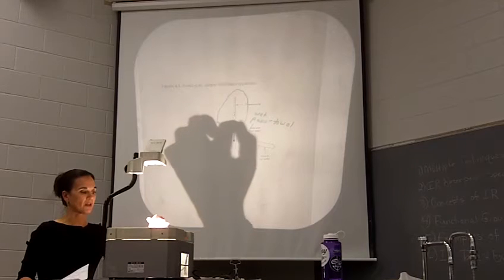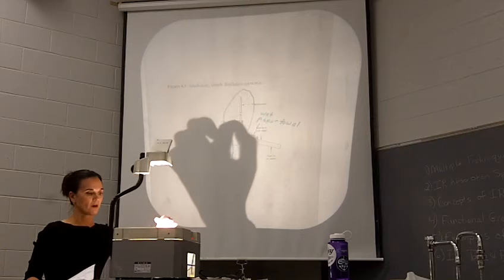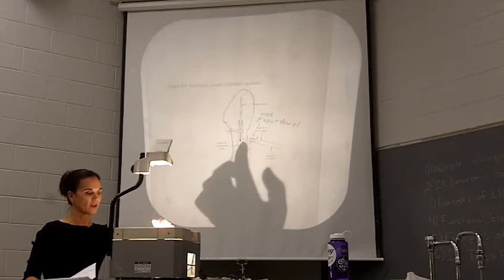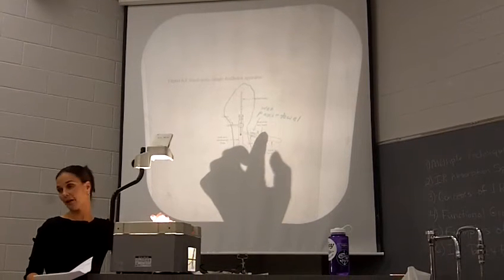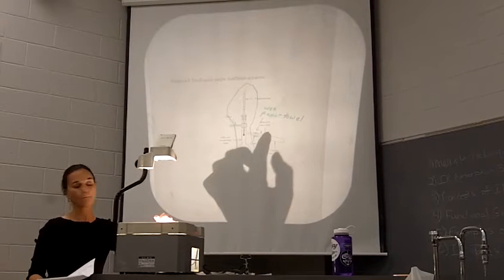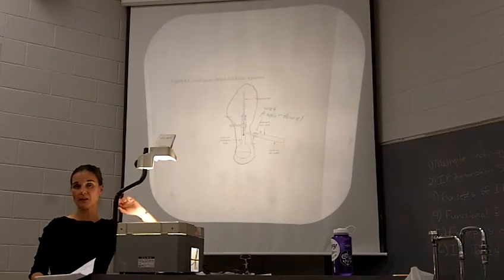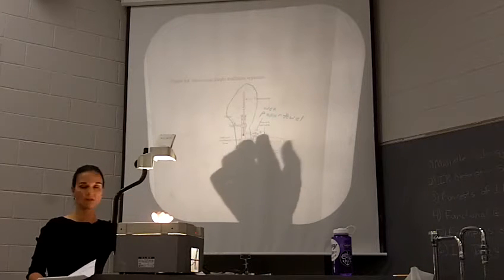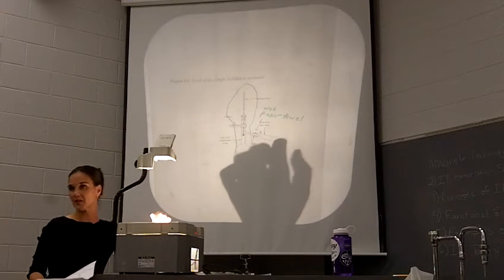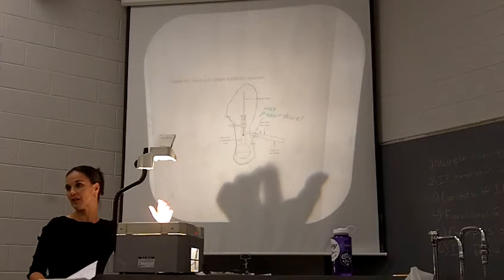There is a stopper in your common equipment that will help you get your thermometer to fit, so it's a #1 stopper, fit into your apparatus. And then you're going to use eventually your test tube that has a side arm on it to collect whatever distills over, okay? Now what you may get in setting up this distillation is a little bit of liquid that comes before it settles at a certain boiling point. So you'd want to collect that in a regular test tube and then put your sidearm test tube on to collect the steady boiling liquid, okay? Because that should probably be what your pure unknown is, all right?